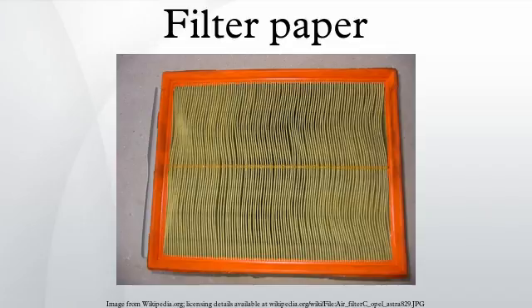Grade 602H. Grade 602H qualitative filter paper has the pore size of 2 micrometer. This grade of filter paper has the smallest pore size among all standard qualitative filter papers. It is used for collecting or removing fine particles. Quantitative filter paper, also called ash-free filter paper, is used for quantitative and gravimetric analysis. During the manufacturing, producers use acid to make the paper ashless and achieve high purity.